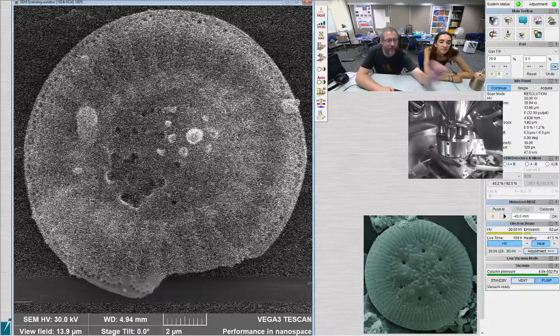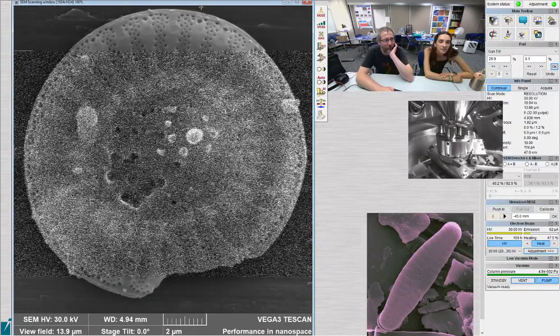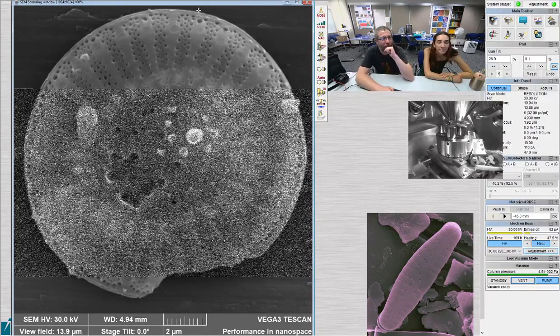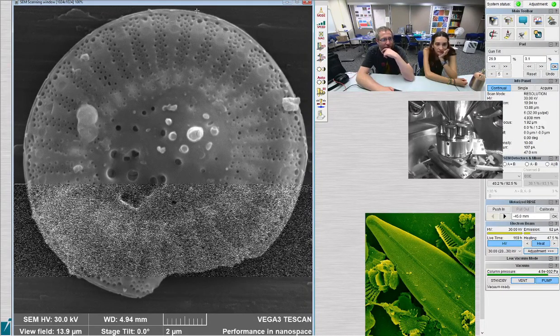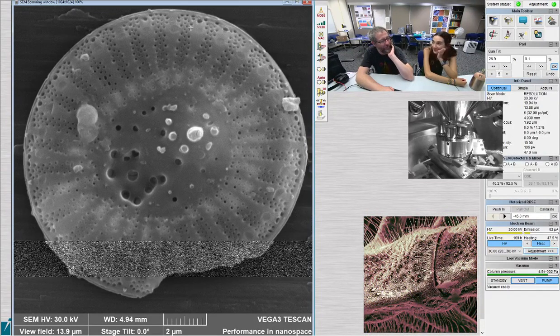It's only really obvious if the beam will go all the way through the slide and then it'll come back and the image will then be somewhere else, slightly off the edge of the page. So I just want to check to see if that's fixed it or not. And then, otherwise, I think it's ready to start collecting images, and then I can let Laura take control. It probably still needs to be stigmated, but you need practice at that.